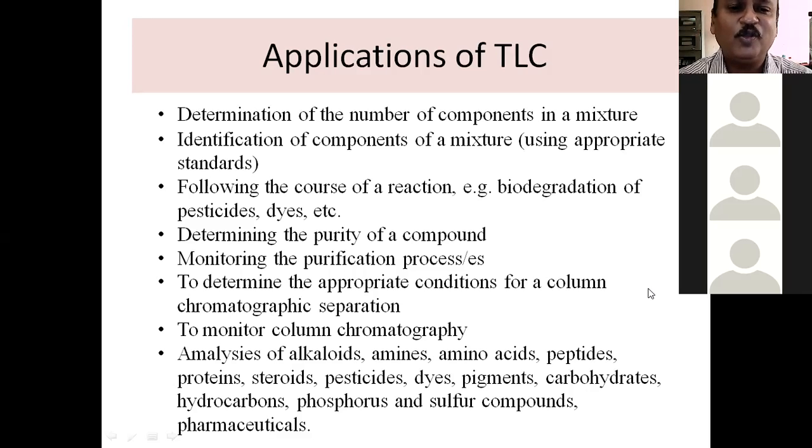How can you follow the course of a chemical reaction using TLC? Repeat the question. How can you follow the course of a chemical reaction or a biochemical reaction or a biodegradation pathway, for example, using TLC?